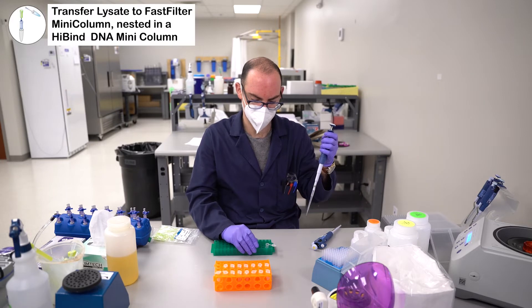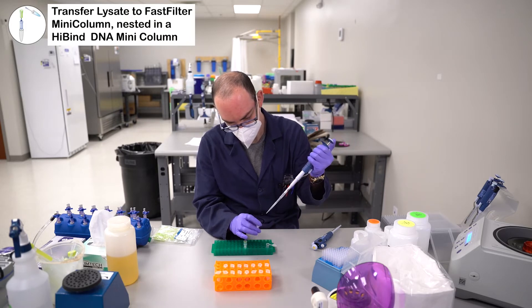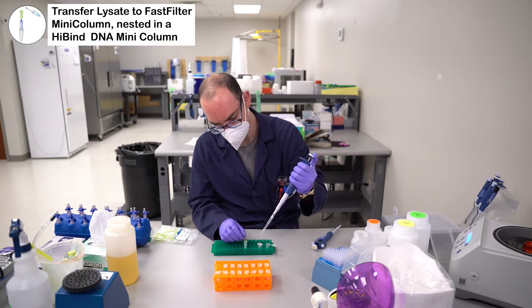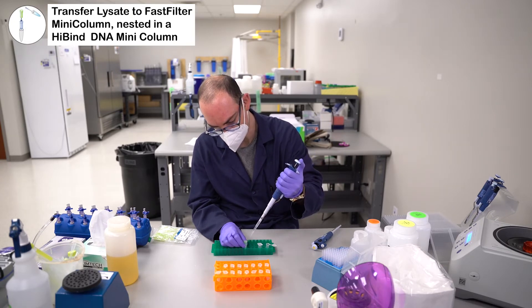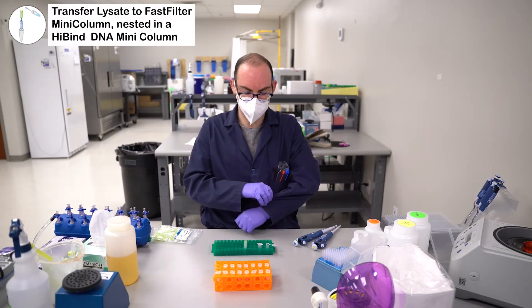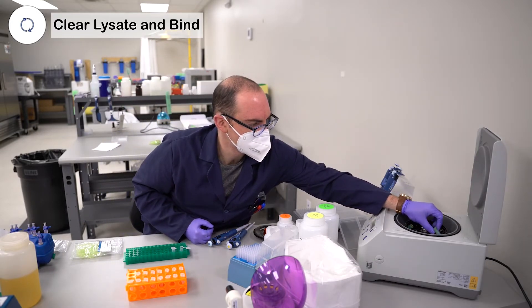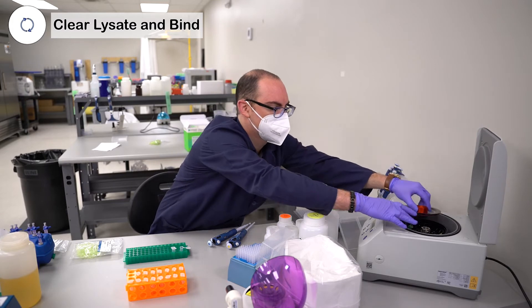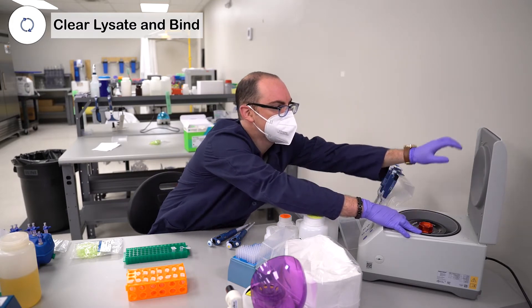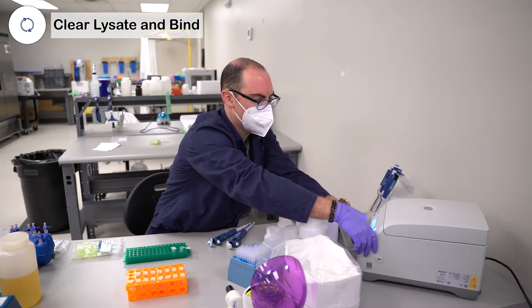Then you're going to take the uncleared lysate from your tube. It's not going to look clear at this point — it's going to look cloudy and chunky with the particulate. You're just going to pipette it directly into the fast filter tube. Take the filled column, put it into the centrifuge, make sure to lock it up, and let that spin for one minute at 13,000 Gs.